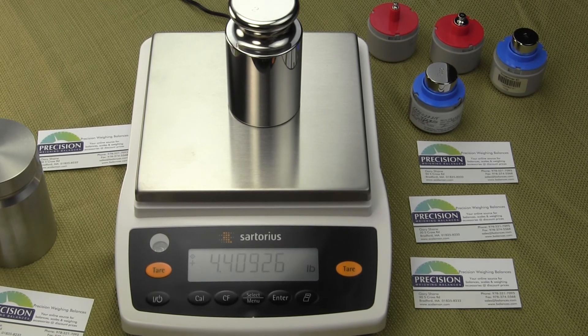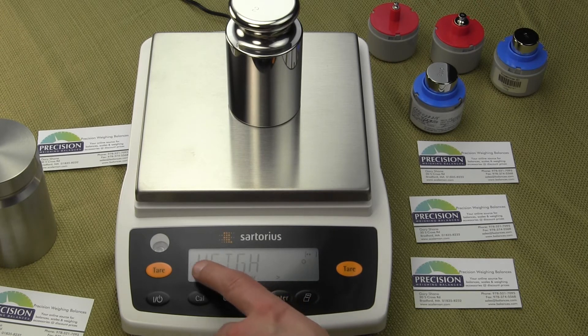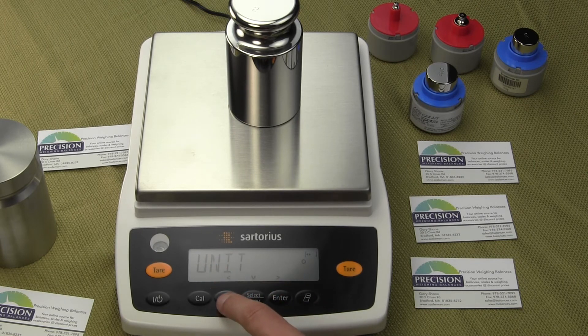Now let's go in and change it so we can toggle between multiple weigh units. To do that, we need to change the application. Press and hold the select menu button again. We're in Application. Press the enter key to get into the application mode — we're in Weigh. Press the select menu key and now we're in Units. You'll notice there's no circle there yet. We want to confirm Units, so we press the enter key — and now you'll see the circle. The application is now set to Units, so we'll be able to toggle between different units. Hit the clear function twice to get out of this menu.